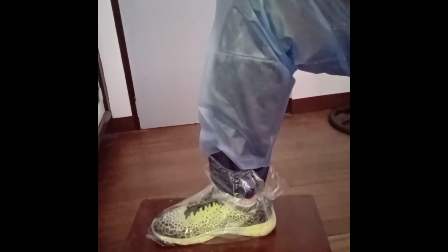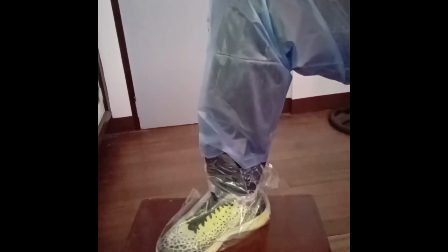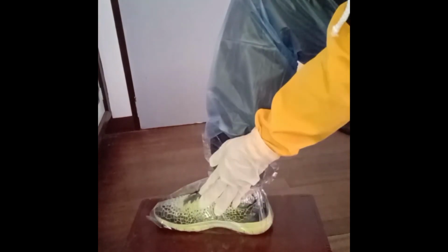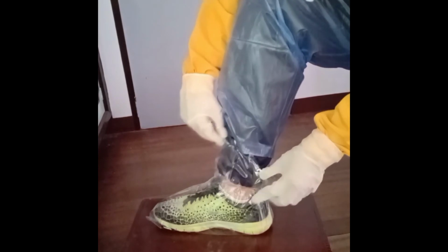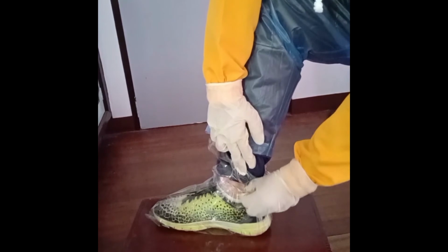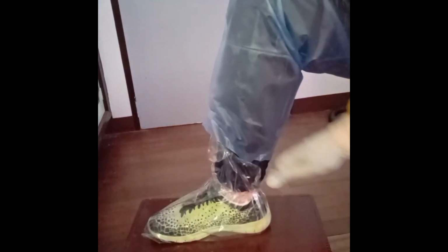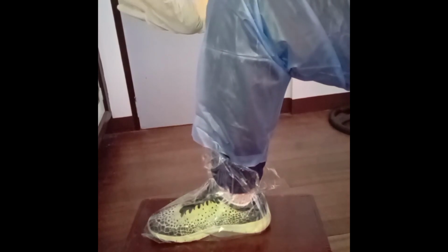The advantage is that the use of plastic to cover closed-toe shoes is important because it protects the shoes of the handler. Protection of the shoes ensures that the handler does not spread the microorganisms to public areas. The disadvantage is that the use of plastic bags or wrap may not provide an effective seal compared to laboratory grade shoe covers. The shoes could possibly be contaminated, spreading the microorganism into public areas. That's all for feet protection.